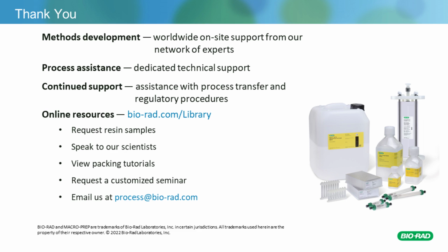And what are the benefits of using the cation exchange resin for insulin? Yeah, so we found Nuvia HRS was really good at resolving closely related products. This resin has a smaller particle size, which could be used for intermediate polishing. And so it was able to remove cleavage products like proinsulin and the ZZ tail, which have PIs that are really close to insulin, around 5.3.